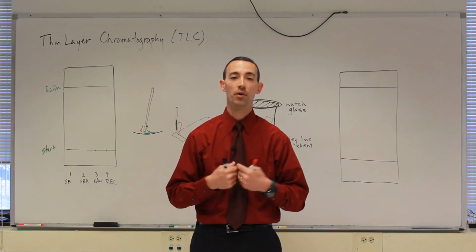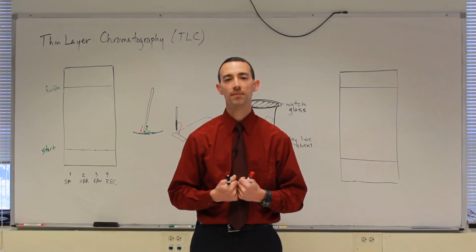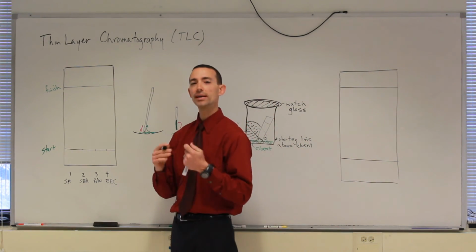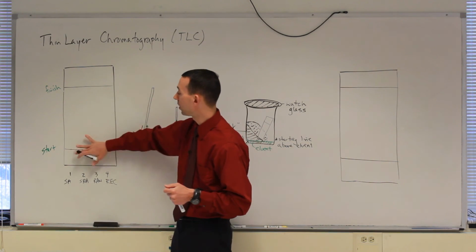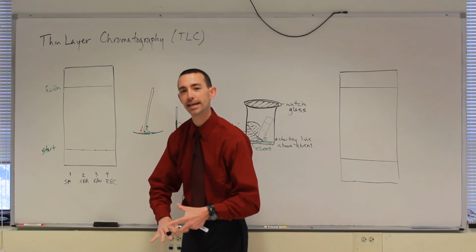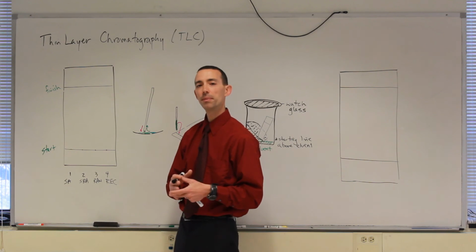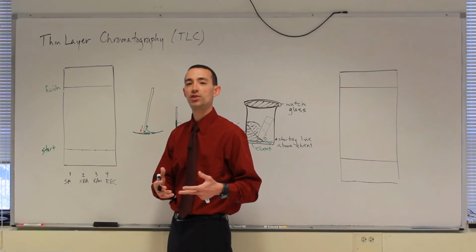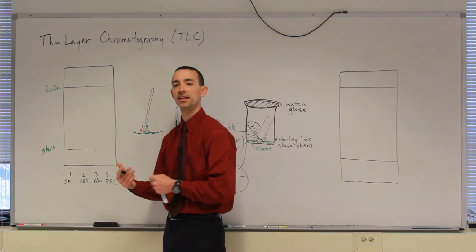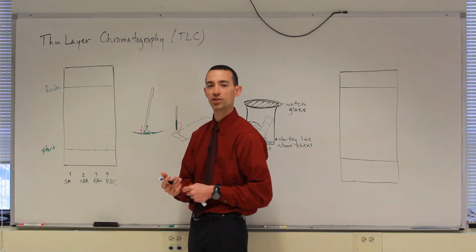And so the more dug in you are to the sand, the less you get moved. So now in the chemistry analogy here, chemicals that really are attracted to the chemical on the surface of the TLC plate are like people who really dig into the sand when that wave comes in. But other people who don't really care at the beach about getting pushed by the wave, or maybe they want to have that feeling, they don't dig into the sand, so as the wave comes in, they get pushed inshore.